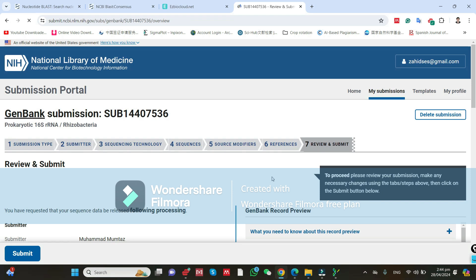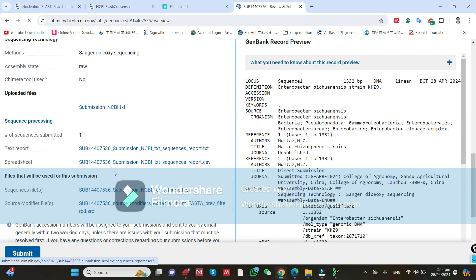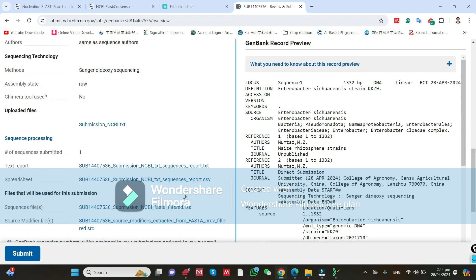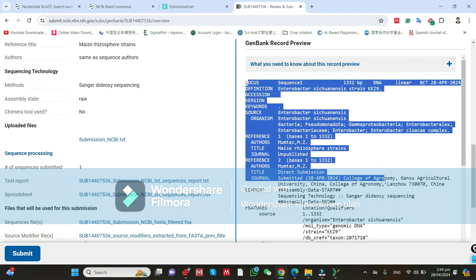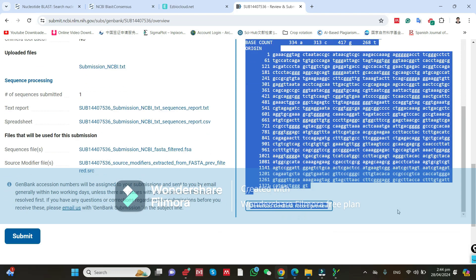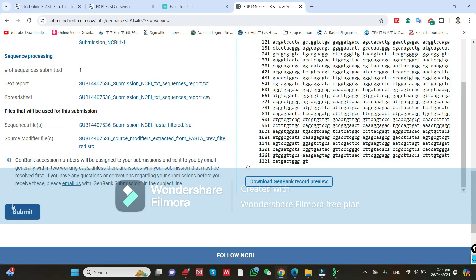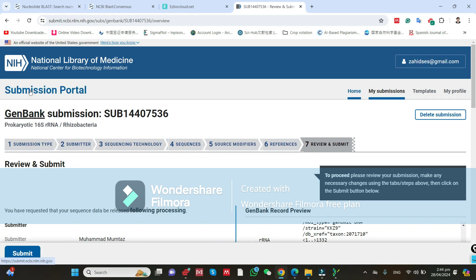Here is the final tab: Review and Submit. You can see all the information, the uploaded file, and all the sequence data that NCBI will show publicly. After reviewing, click Submit — it will submit directly to NCBI. I am not clicking it because I have already submitted this strain.